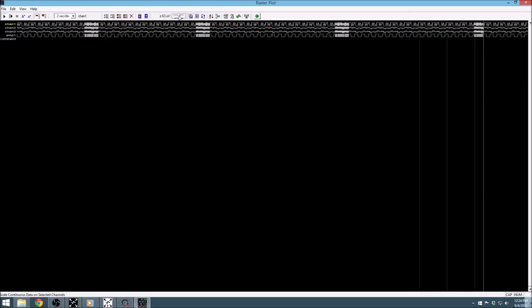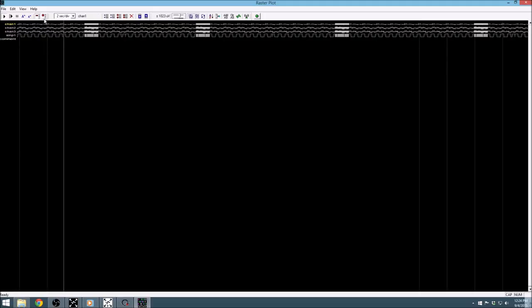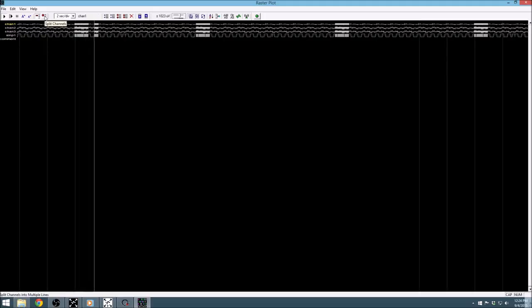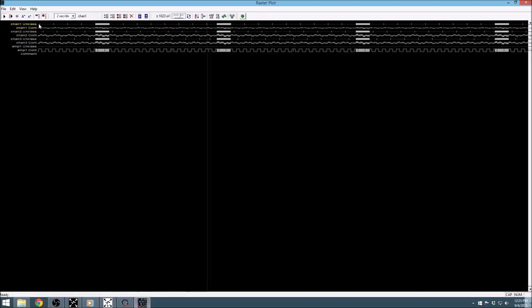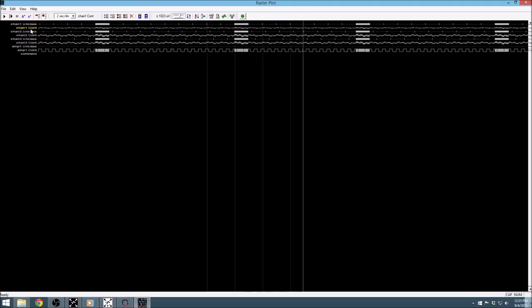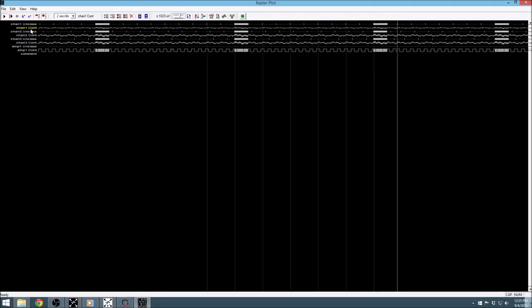Now, sometimes it can be difficult to see the spike ticks through the continuous signal, or vice versa, so it may be best to separate the two signal types. To make it so that the continuous data and the spike data are not overlaid, you can press the plus button icon to break out every channel into its separate data streams. For channels with spikes that have been sorted into units, this would also separate the units into separate lines. In the case of digital inputs, it would break it into separate bits. To reverse this breakout, we can simply click on the minus button.